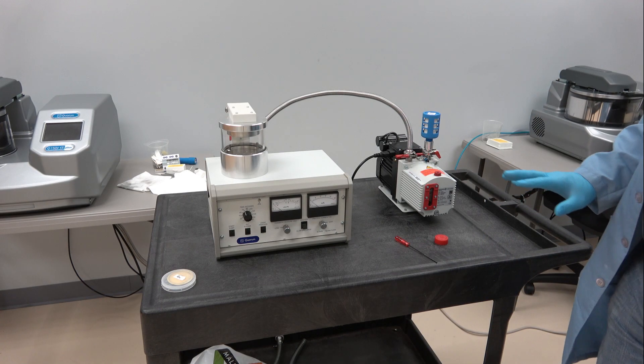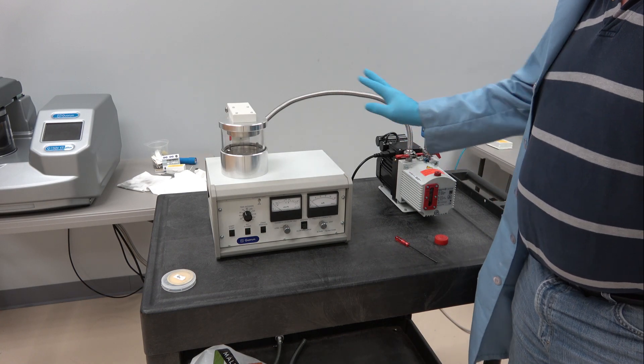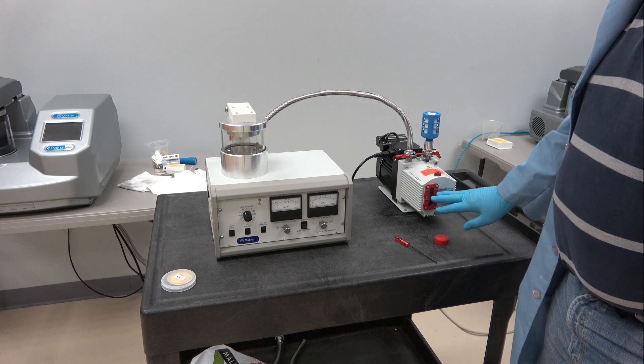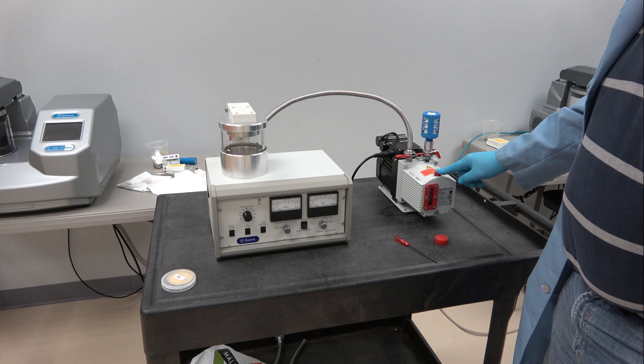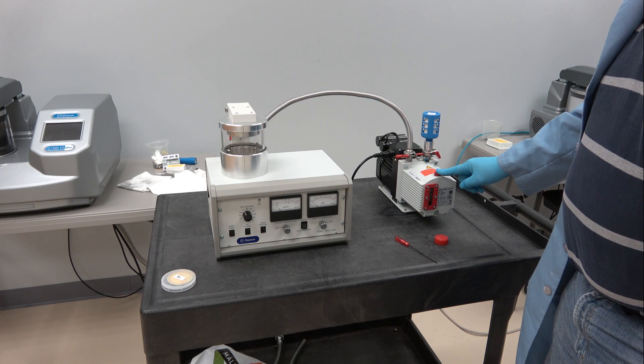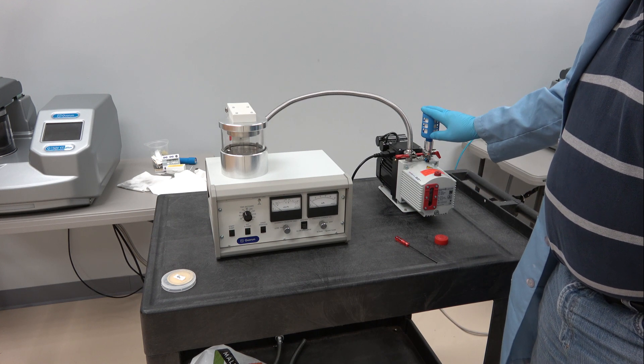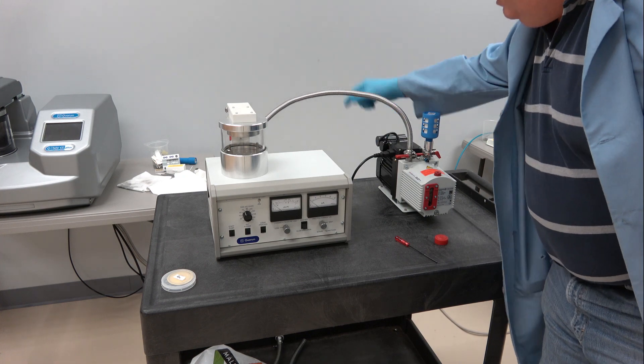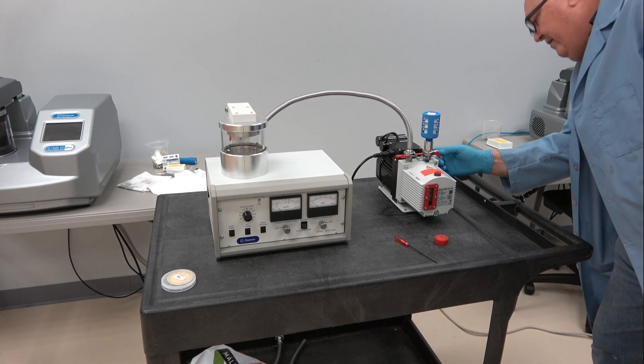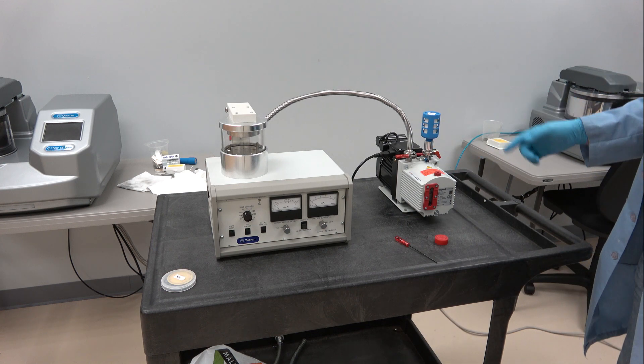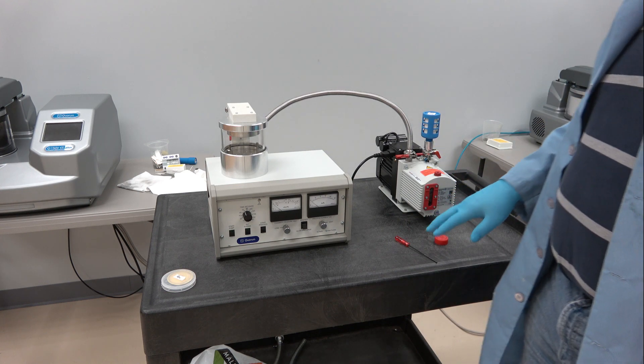I went ahead and connected everything up. Put oil in the rotary pump, this is the fill port for that. Put on the exhaust filter. Plugged this into the back of the coater. Make sure that we'll have to check if the on-off switch is actually in the on position.